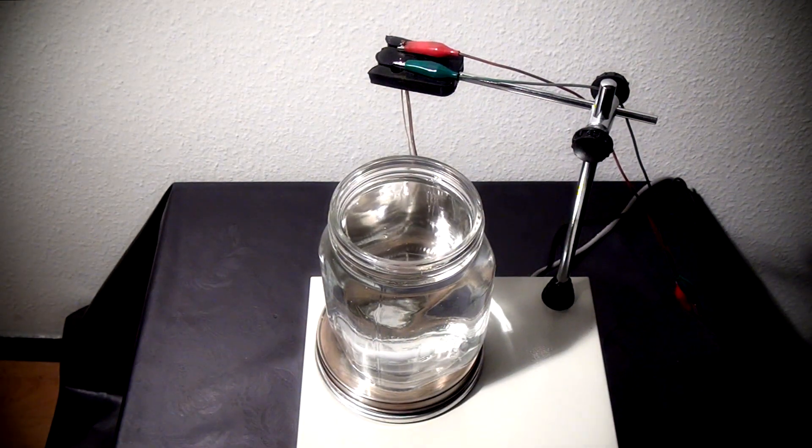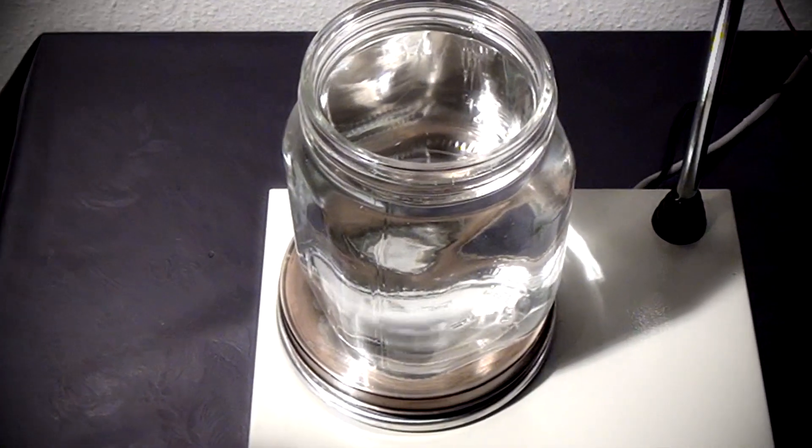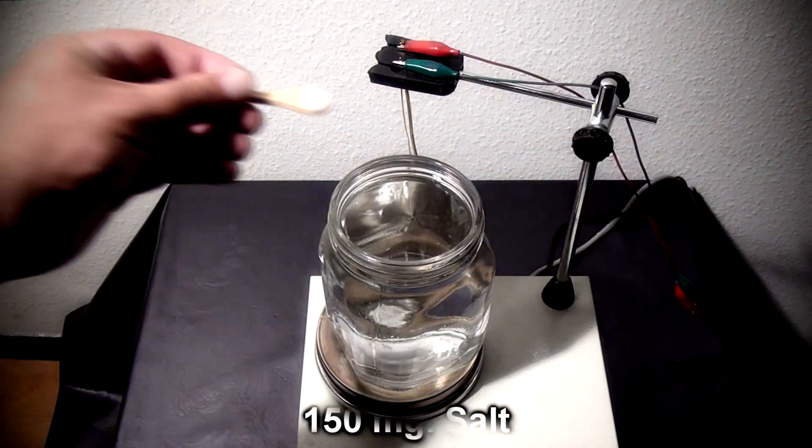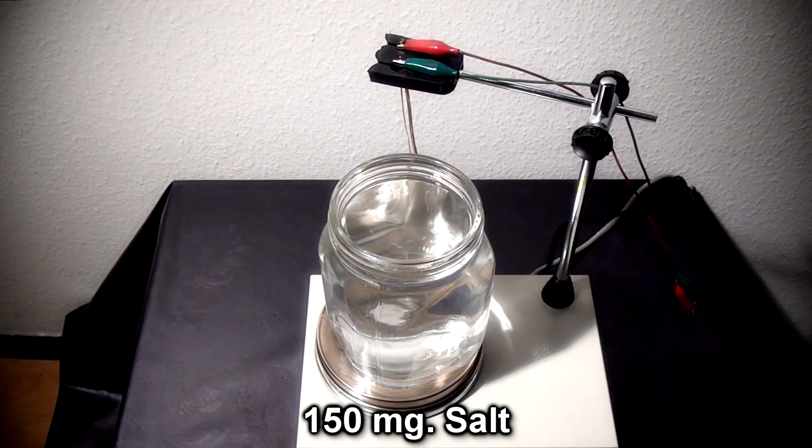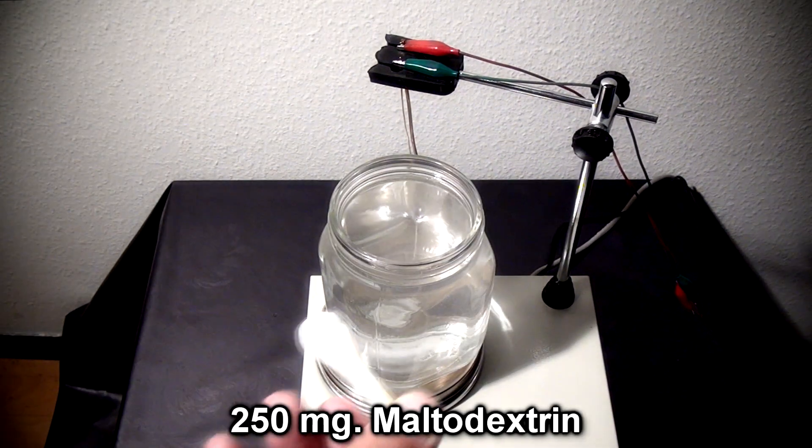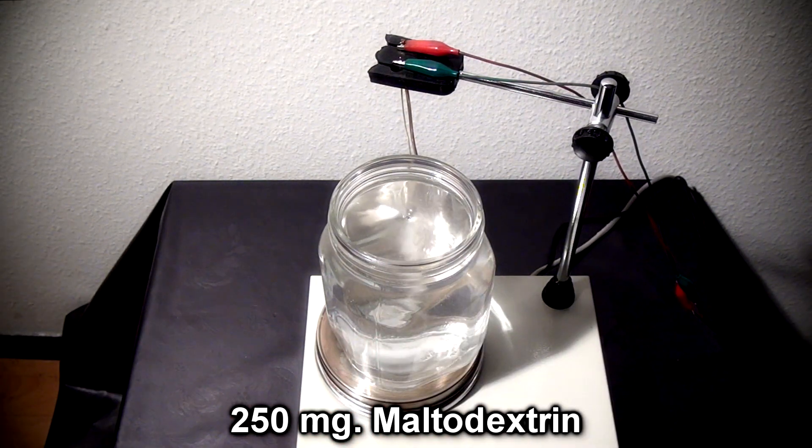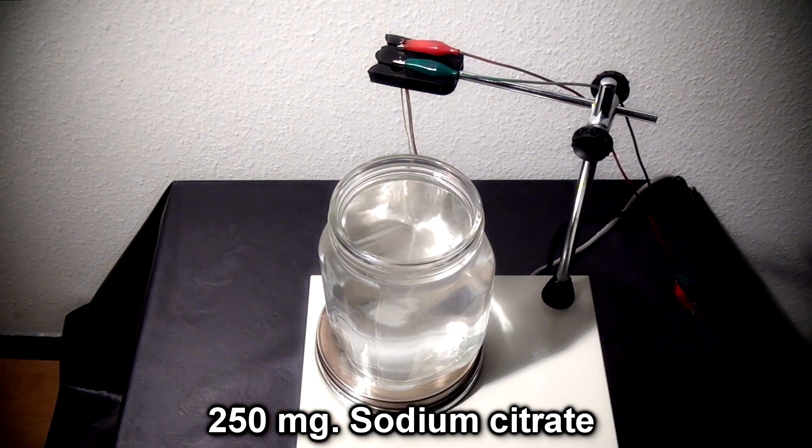I gently insert the magnetic stirrer into the glass and screw the magnet motor up to 30%. Then add 150 milligrams of salt, 250 milligrams maltodextrin, and 250 milligrams sodium citrate.